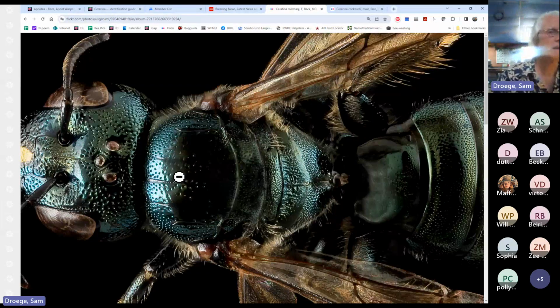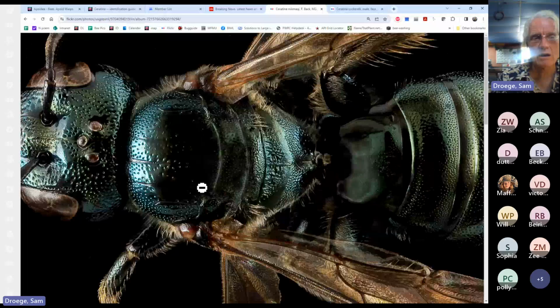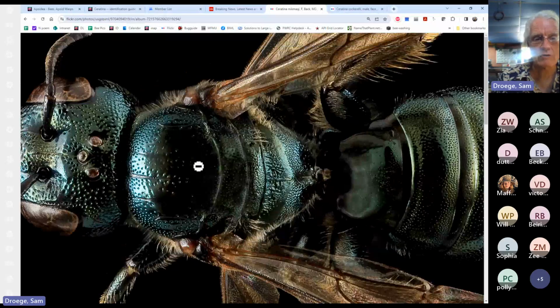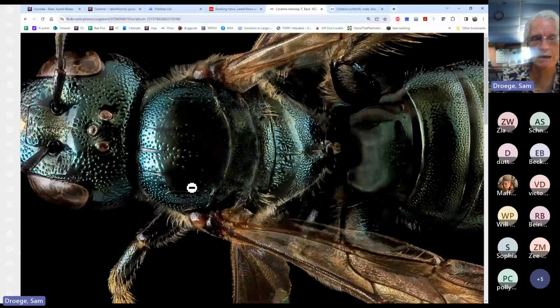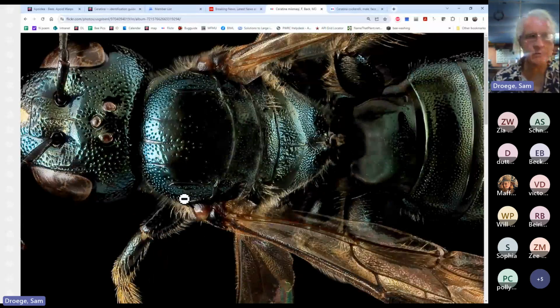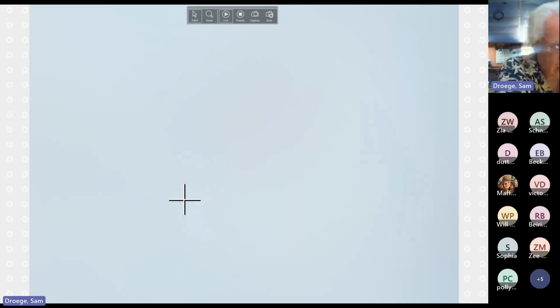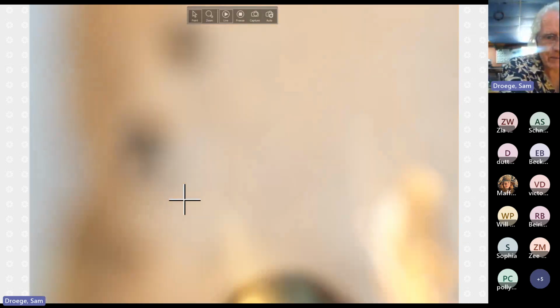That's basically your separation of dupla from the calcarata-mikmaqi clan. With this, you can't separate out calcarata, since calcarata and mikmaqi have essentially the same pattern of pits on the scutum. I'm going to flip to the microscope and see if we can replicate this in a specimen.